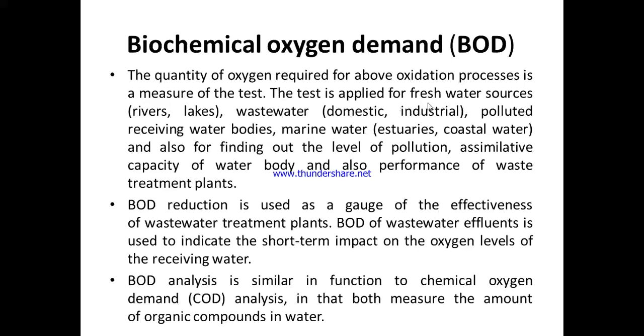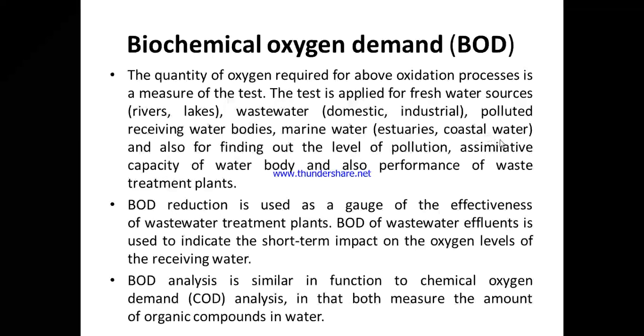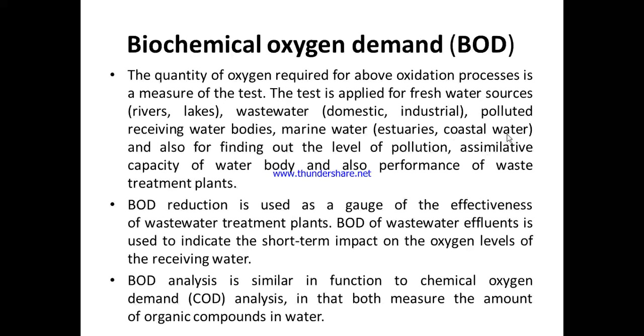The test is applied for fresh water sources like rivers, lakes. You know, rivers and lakes are having ample quantity of dissolved oxygen, and they are having the capacity to decompose, oxidize huge quantity of organic matter. Okay, and that is why the DO level would also be high. Wastewater, that is domestic and industrial wastewater, polluted receiving water bodies, marine water, that is estuaries, coastal water. Coastal water are the water available in sea and oceans. Okay, all those regions they contain coastal water.